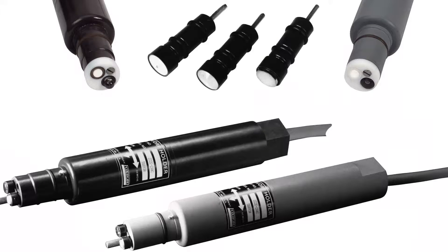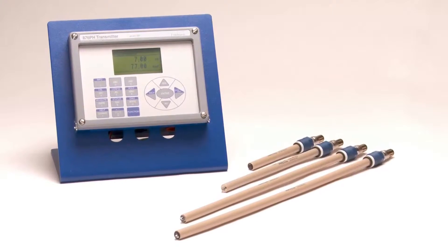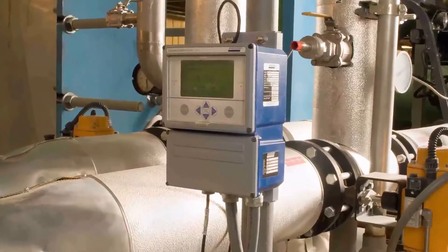For over 50 years, our high-quality liquid analytical instruments, which includes our sensor technology, has revolutionized the field with its pH standard and remarkable longevity in the harshest environments. Our outstanding ease of use in any application has made our sensors the industry benchmark for pH and ORP.